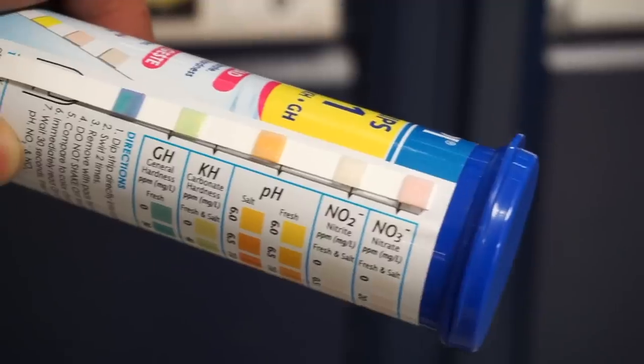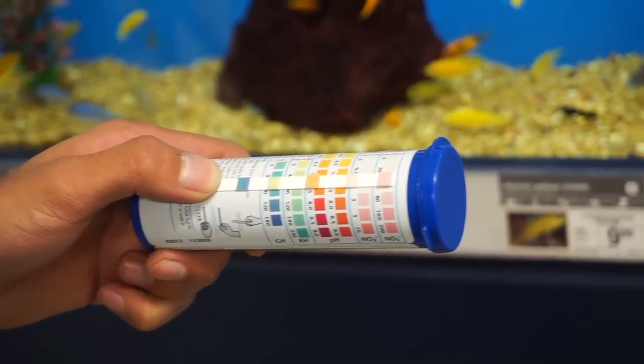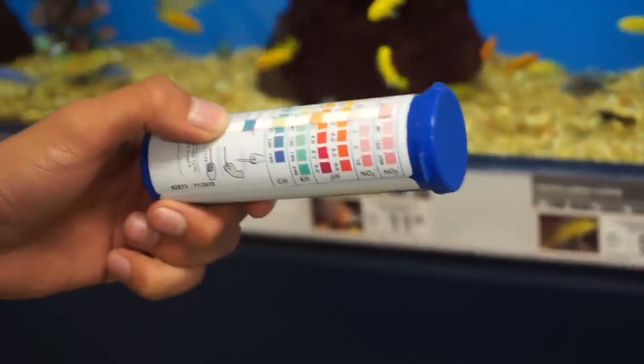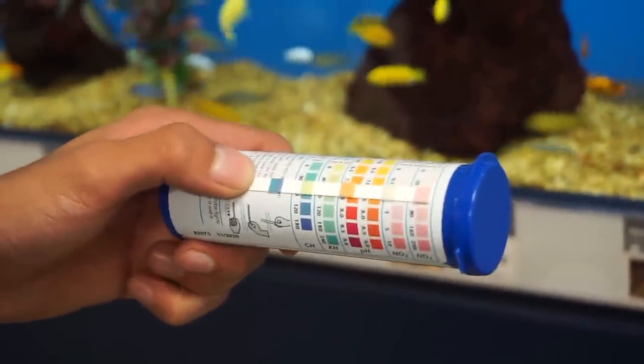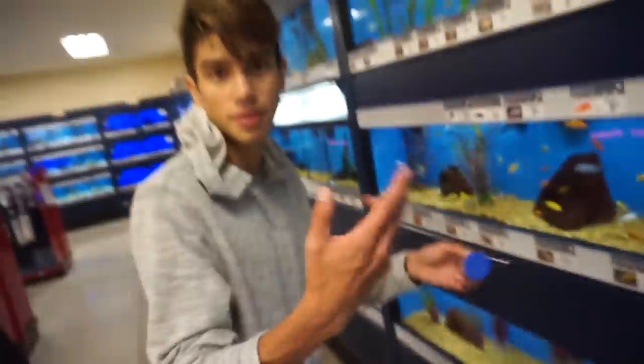You can see the nitrate is already so high — yeah, that's high. It's starting to turn more pink. Let's see if it's matching up. I think these are parts per million, so it's like 80 parts per million of nitrate. But let's do a couple more tanks. I'll save these other results and just add them up at the end and see how the tanks go.